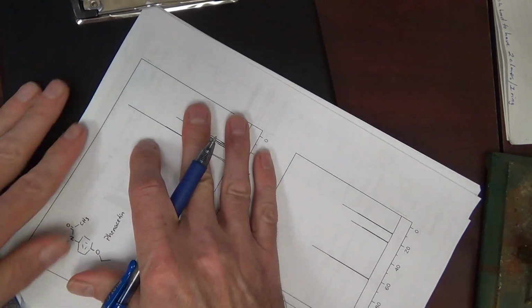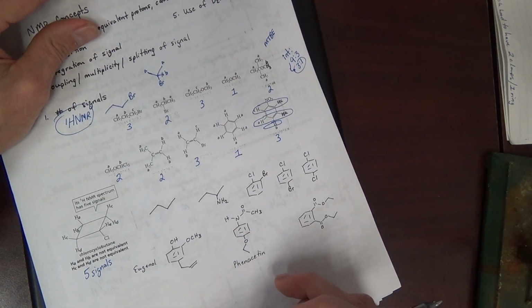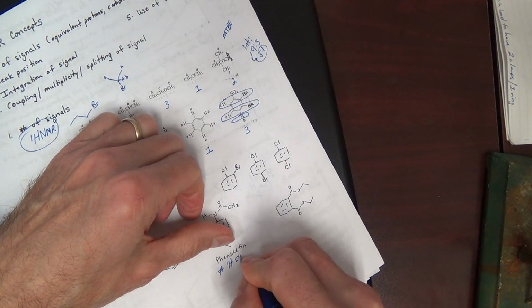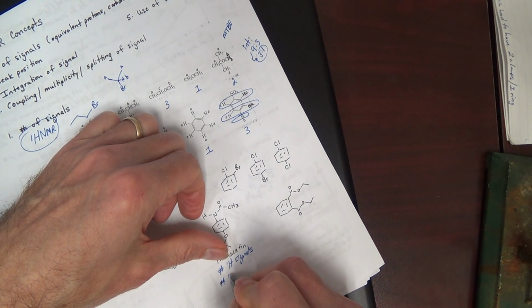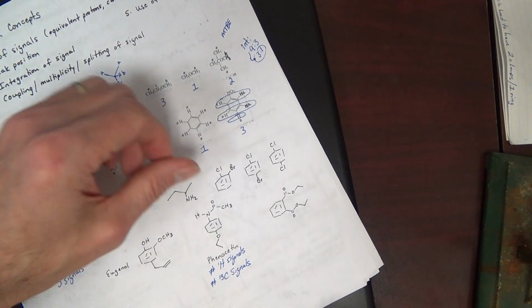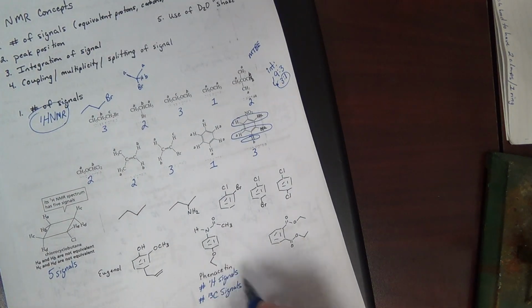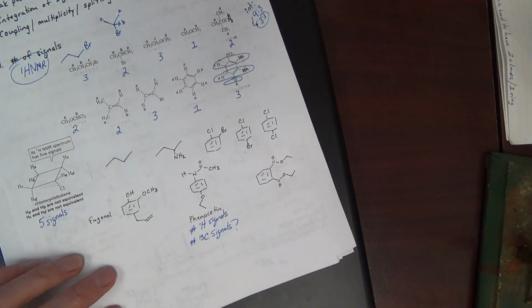Don't look. Determine number of 1H signals, but also number of 13C signals, or just carbons. We'll talk about how many unique types of carbon are in this compound. Do that as well for phenacetine.